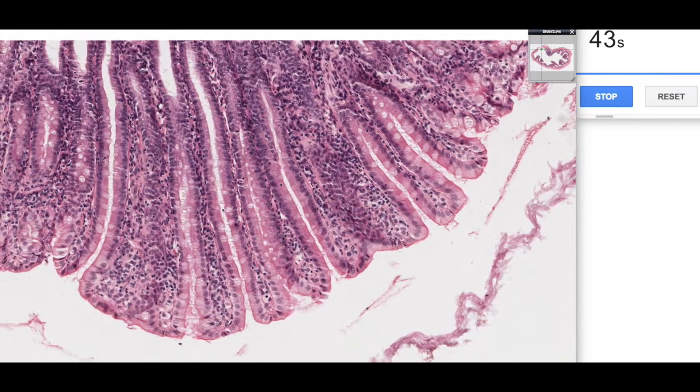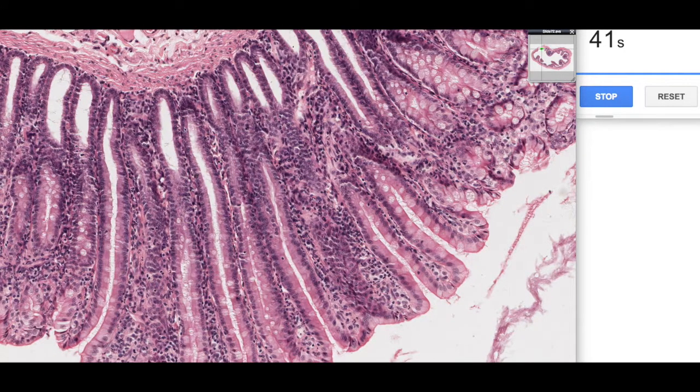So as I said, we have these simple straight tubular glands. Again, we find mitotic features down the base of these intestinal glands. We've got lamina propria in between.